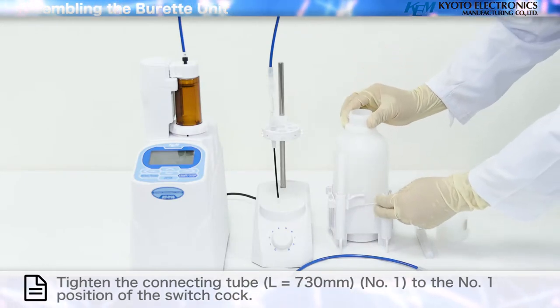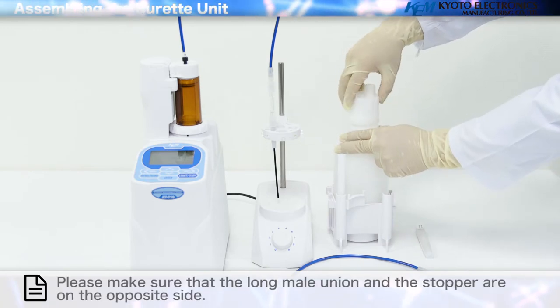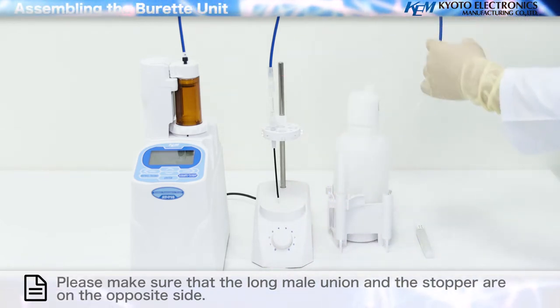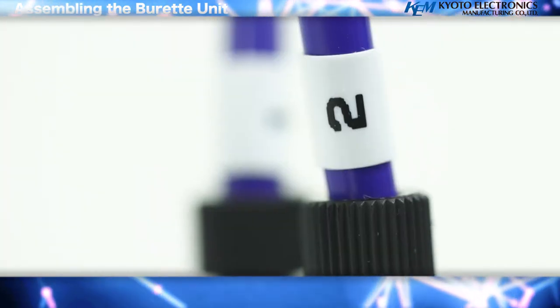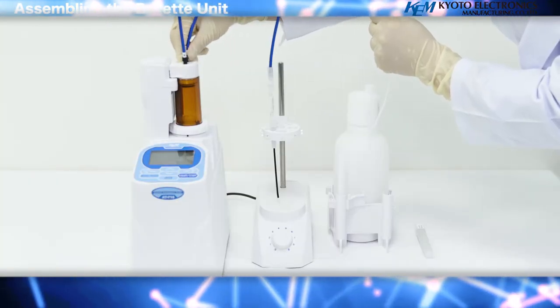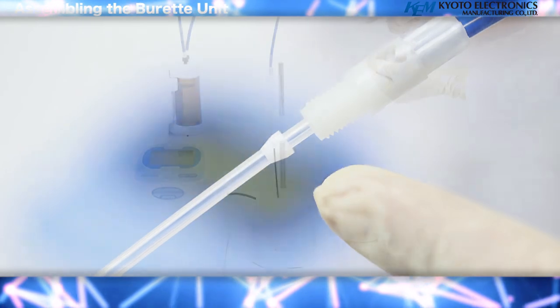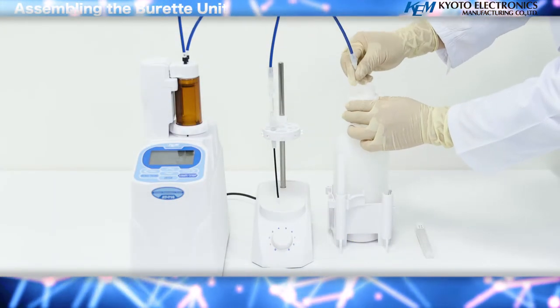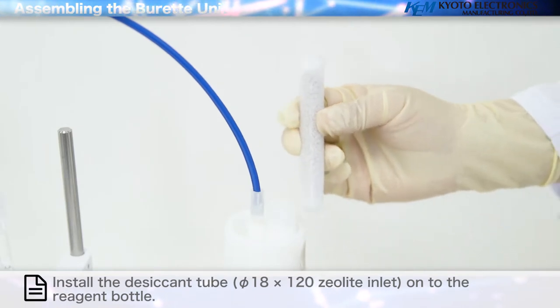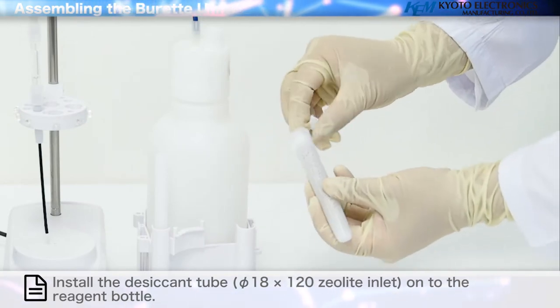Tighten the lid of the reagent bottle and place it on the bottle stand. Tighten the connecting tube to the number one position of the switching valve. Tighten the connecting tube to the bottom of the reagent bottle, making sure that the long male union and the stopper are on opposite sides. Align the tube to a position that ensures it can reach the bottom of the reagent bottle. Install the desiccant tube onto the reagent bottle, and remove the seal of the desiccant tube.